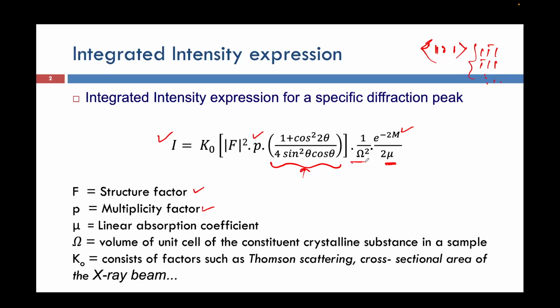It's not like whatever sample we put on the X-ray sample stage, the complete area will be giving us reflection. A certain area will be giving us reflection based on our X-ray beam size. So we have incorporated all these expressions to get our final intensity value.